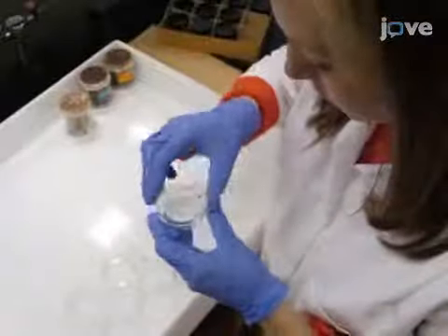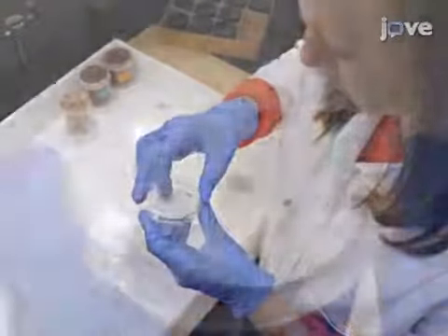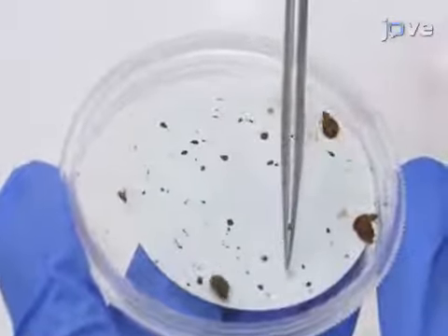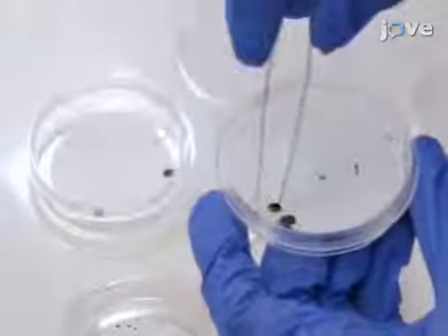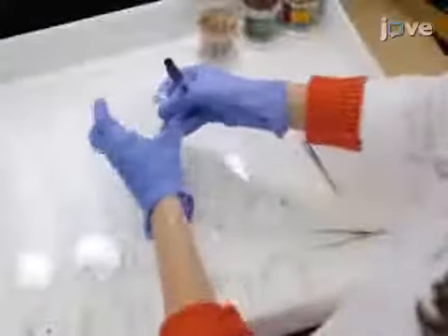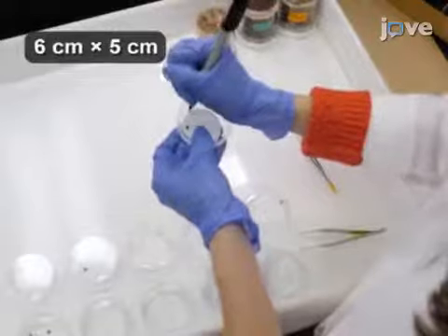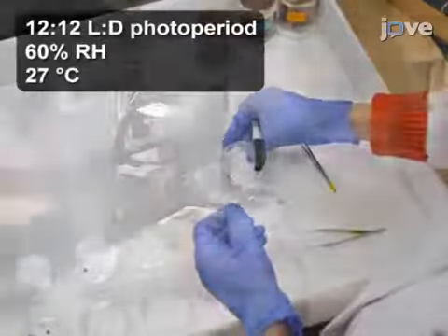Check the dishes every day to see if the females have laid eggs. Once the females have laid eggs, take the females out of the petri dish and put them into new petri dishes with a new filter paper daily. Record the date on the old and new petri dishes. Allow the eggs to age 4 to 5 days before starting the assay.